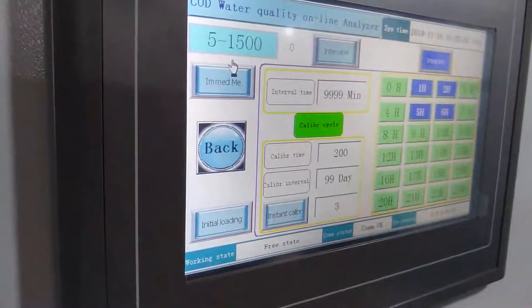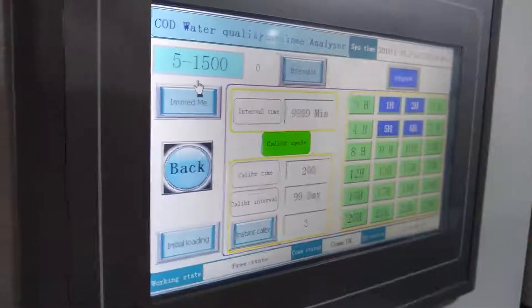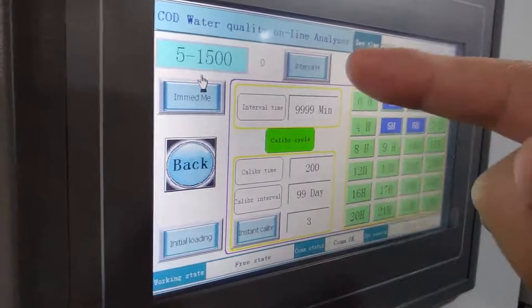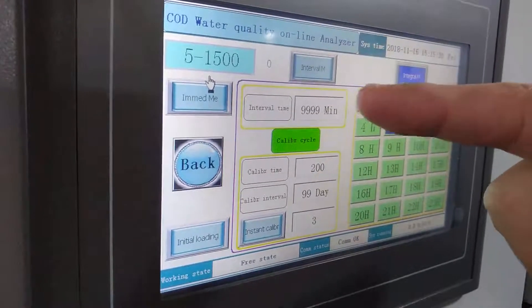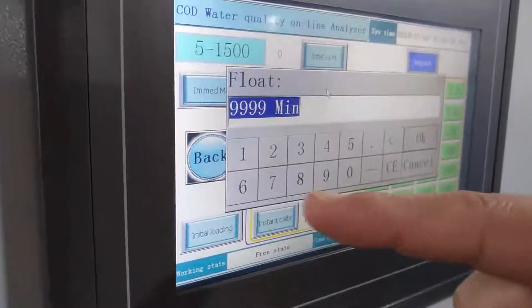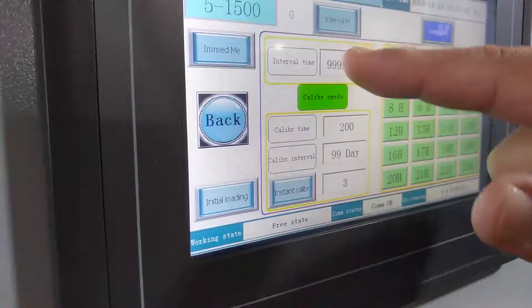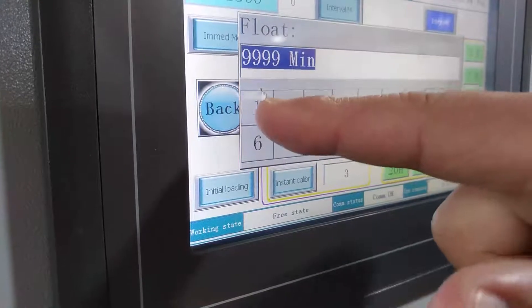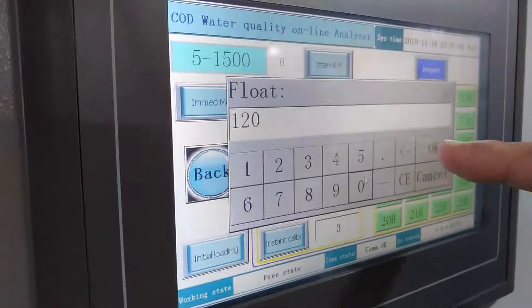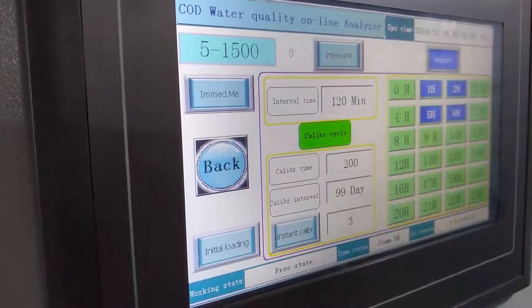In this screen, you can see this interval time. There are two modes: one is the intermittent interval mode, where you can set the time. For example, if you set two, then it will start to measure every two hours.